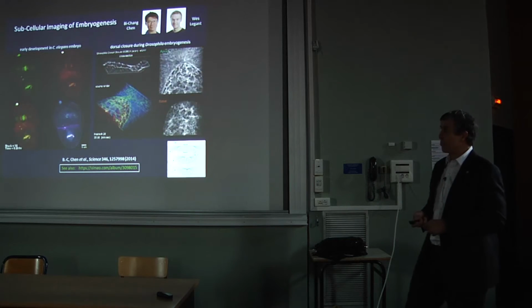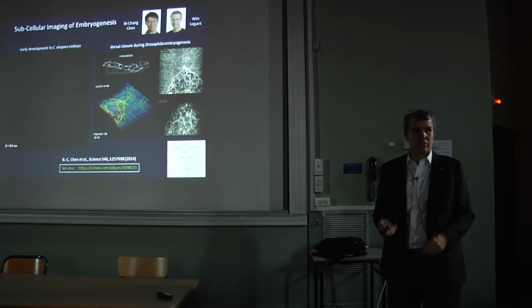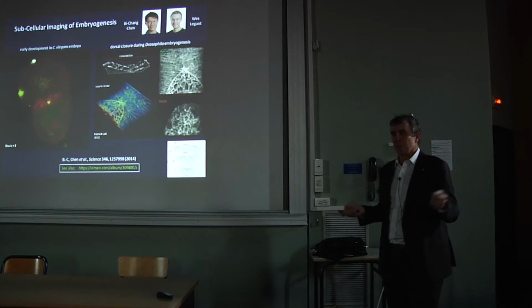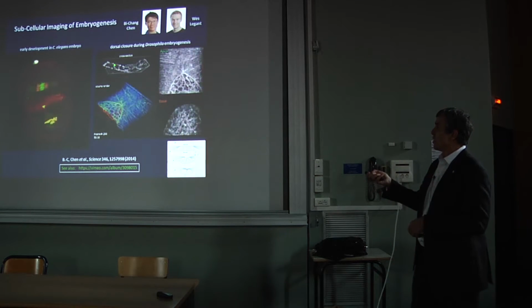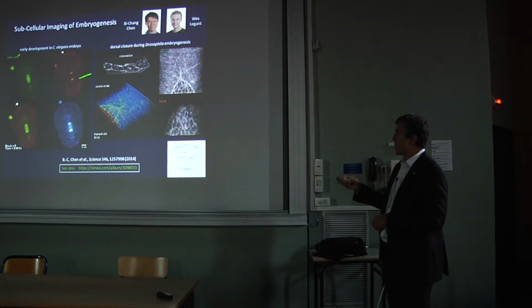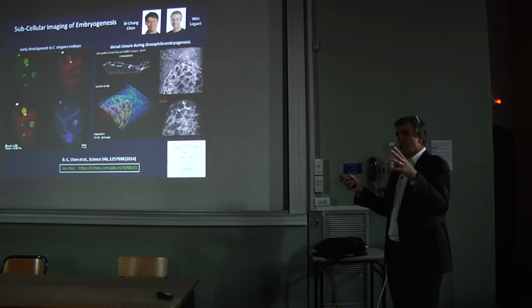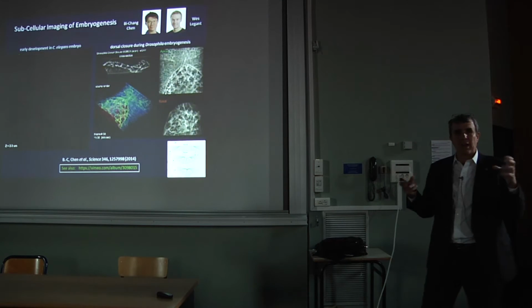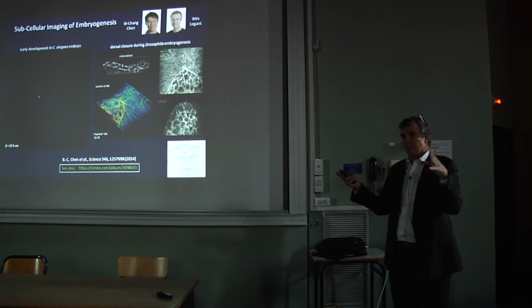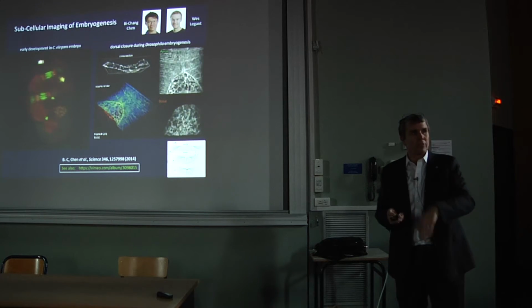In this case, we're looking at dorsal closure. So this is an entire 500 micron big Drosophila embryo, fruit fly embryo. And although we can't look through the whole embryo for reasons I'll get to in a few minutes, we can look through the top layers, and so we can actually look at both the top and bottom layer of that top layer of cells called the amnioserosa, and they go through these pulsating contractions and expansions of the actin cytoskeleton. We've been able to show that those contraction expansion phases are 180 degrees out of phase between the bottom and top surface of those cells.